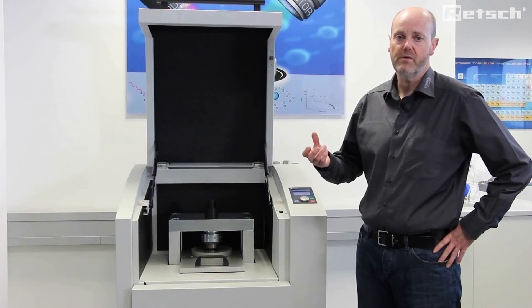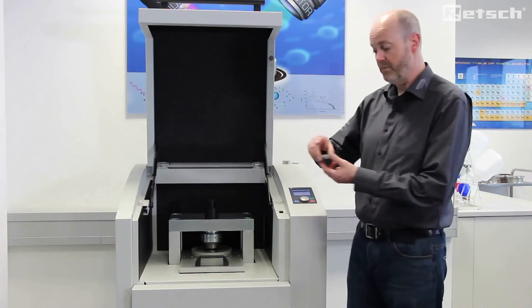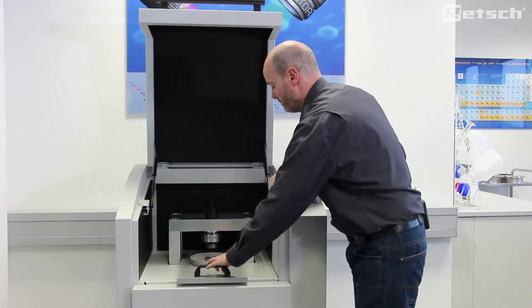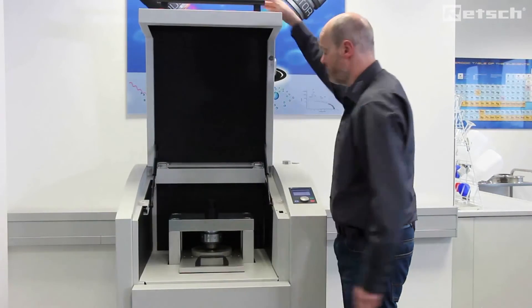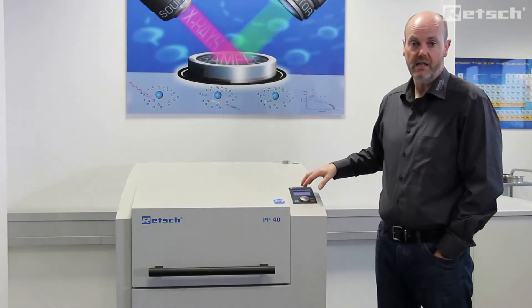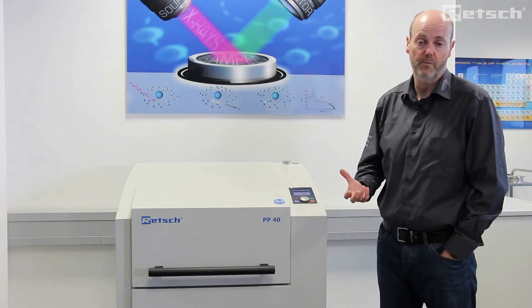Then, after the binder and milled material are mixed thoroughly, we will typically add the material to an aluminium cap, place it into the pellet press, close it, set the preset parameters, and simply press start to make the optimal pellet.